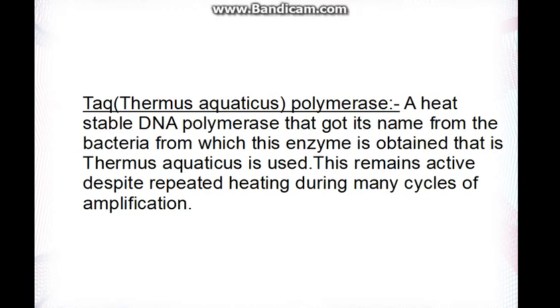Then we require an enzyme known as Taq polymerase. Specifically, it is obtained from a bacteria, because we need a heat stable DNA polymerase. We want it to remain active despite the fact that we will repeatedly heat it during many cycles of amplification.